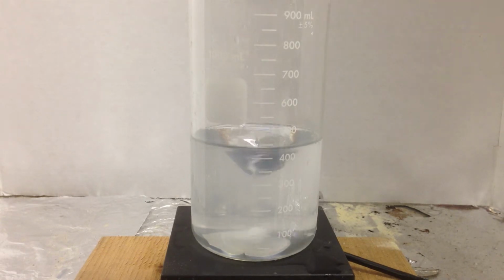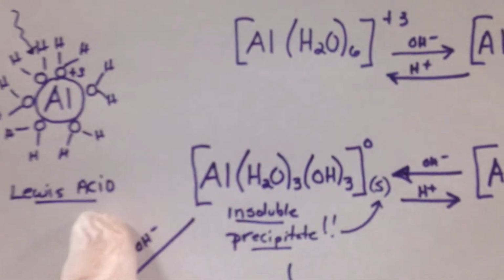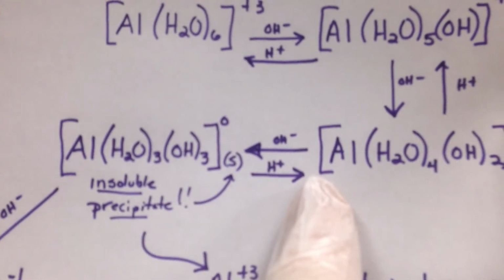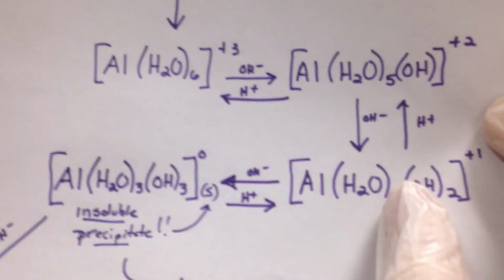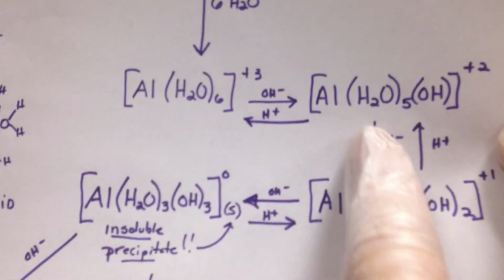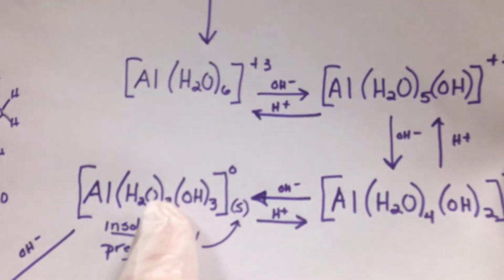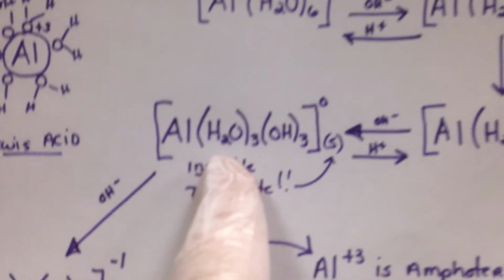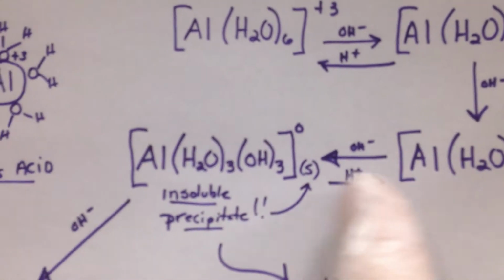Well, because very simply, from this precipitate here, adding H pluses, I'm able to reprotonate those water molecules and now make it into a charged compound. And once it's charged, the water can attract it and dissolve it. All right, so I'm going back that way. But that's still not what proves amphoteric properties, because most things that are hydroxides, whether they're insoluble or not, are going to be affected by a strong acid.